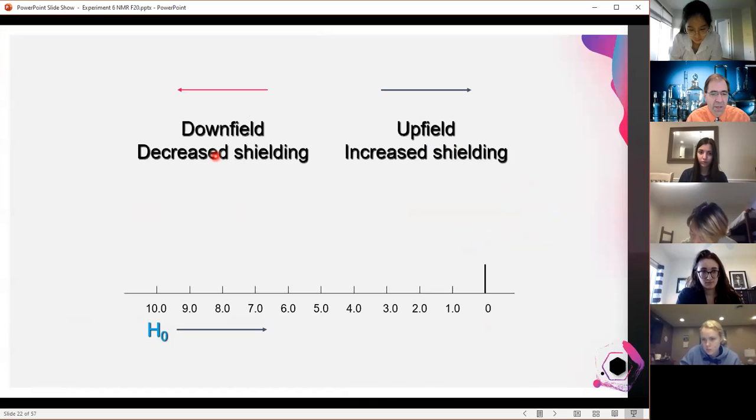Okay, so when you get a spectrum out of it, you get a scale. For proton NMR, it starts at 0, usually goes up to about 10. You can get further. I did some research on some molecules that are around 18, but most things are under 10. Carbon NMR starts at 0, goes to about 300. It just has to do with the different strength of the fields.